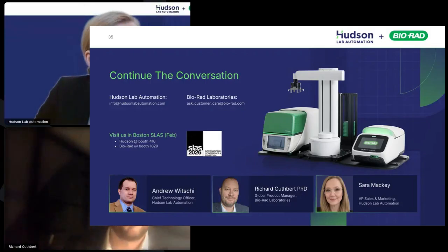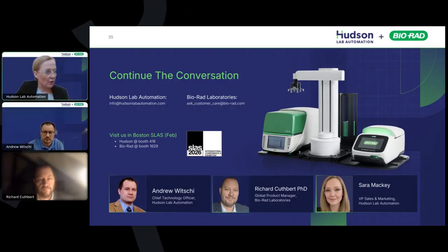Perfect, thank you. Another one for you, Andrew. So you've shown a robotic arm automating plate loading in front of an instrument. Does one arm typically map to one instrument, or can a single arm serve multiple instruments, such as 2 or 3 flow cytometers, and how do you architect that?